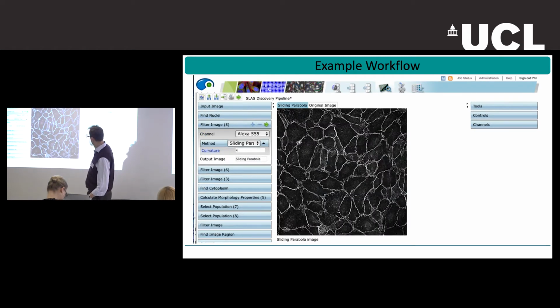The second thing is when we look at the junctions. We go into a slightly more problematic field, because in this case we wanted to do two things with the junctions. The first thing was finding the cell, because as Davide said, we have to find the cell before we can ask questions. We want to know, for example, the morphology of the cells.